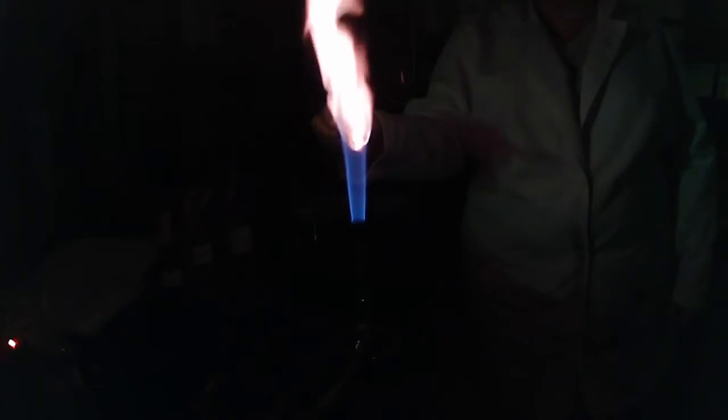Now, if anyone knows me, this one is my favorite. Okay, so this is potassium. Potassium turns it purple. It's my favorite color. Potassium turns flames purple. So this is the frequency energy from those electrons going up into the excited state and back down, making a purple.